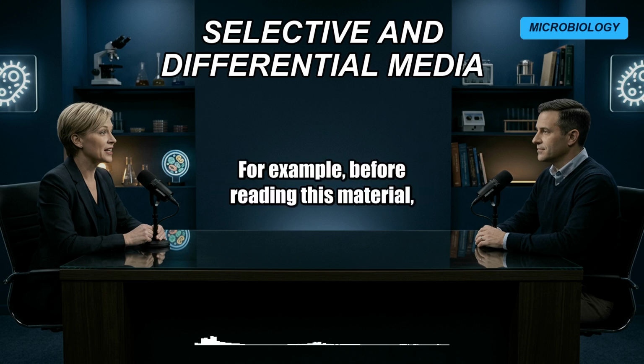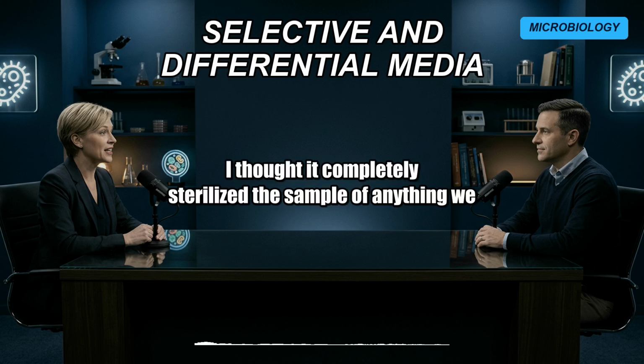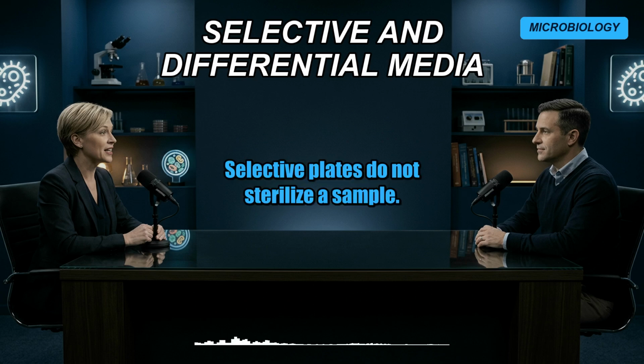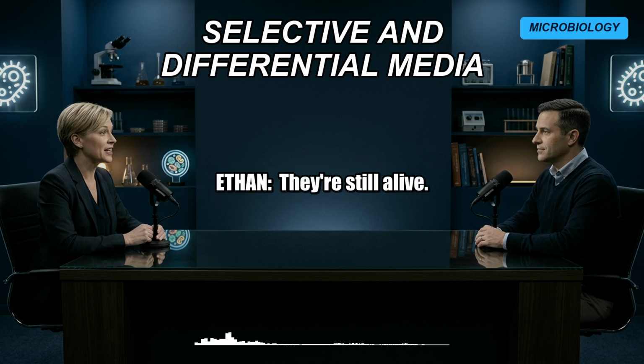For example, before reading this material, I assumed a selective plate acted like bleach. I thought it completely sterilized the sample of anything we didn't want. That's a very common and honestly potentially dangerous misconception. Yeah. Selective plates do not sterilize a sample. They merely inhibit the growth of non-target organisms. Wait, they're still alive?